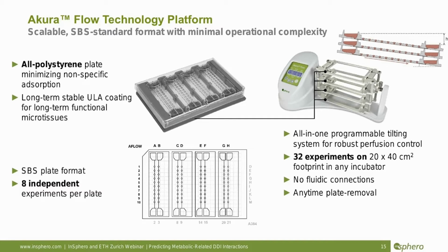So therefore, we don't need any fluidic connections, and we can stack multiple plates inside an incubator to run many experiments in parallel at a very small footprint. Also, we can remove the plates anytime for medium sampling, for medium exchange, or for imaging on an imaging system.